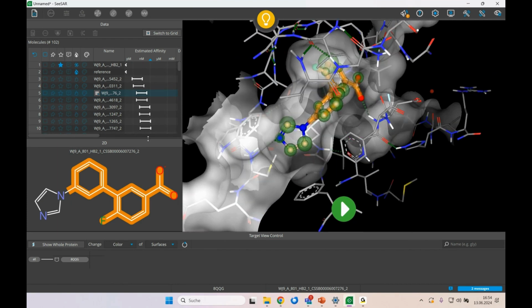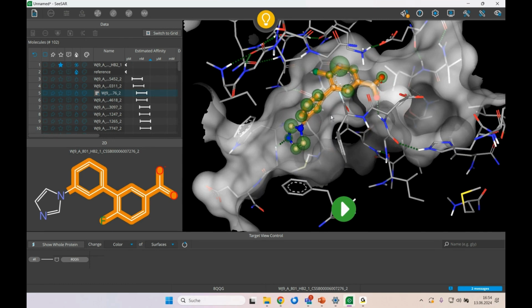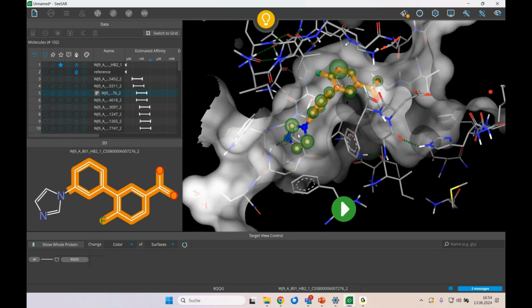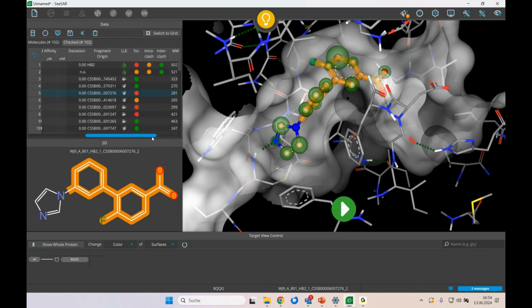I'm completely fine with having the fluorophenyl and this phenyl group in this arrangement, where they are kind of shifted or twisted by 90 degrees. I doubt this conformation though. So maybe let's check the torsions for all compounds, because in my mind, they should be at least planar to each other. Yeah, unless there is a good reason for it. But let's double check.